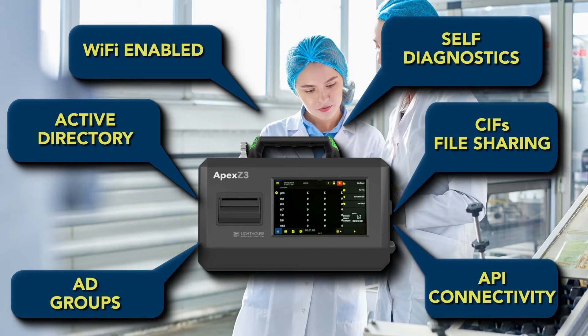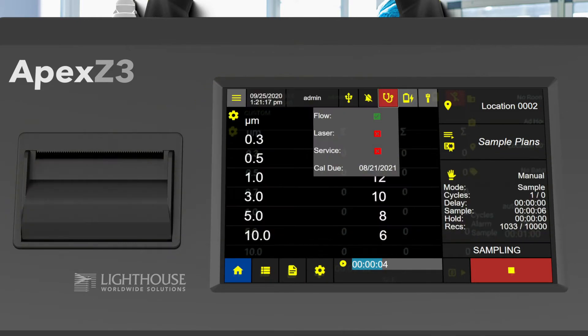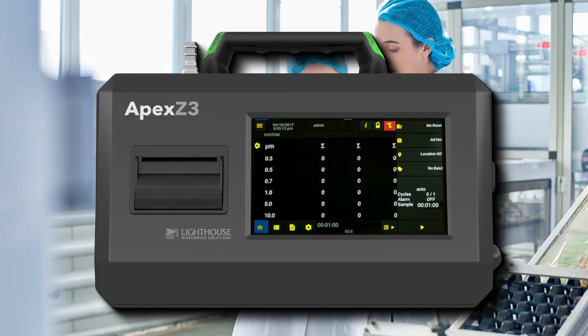When it comes to data integrity, we have you covered. The Apex Z self-diagnostics seeks out bad data, as every electronic data record is validated to ensure the particle count data is valid. If the data is questionable, the Apex Z will let you know and mark the data record as bad data.